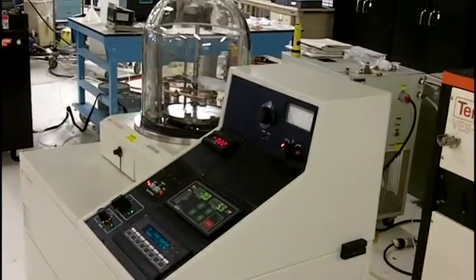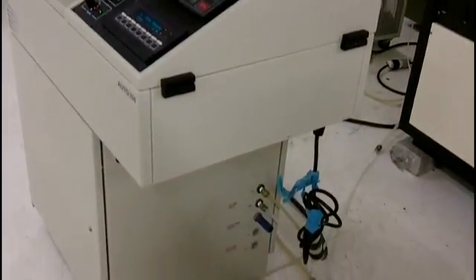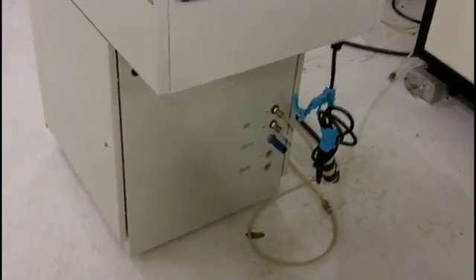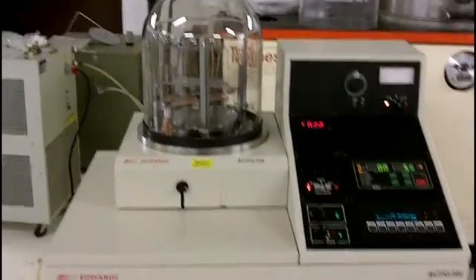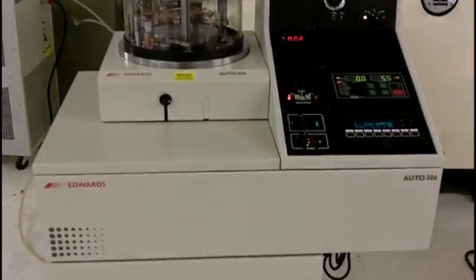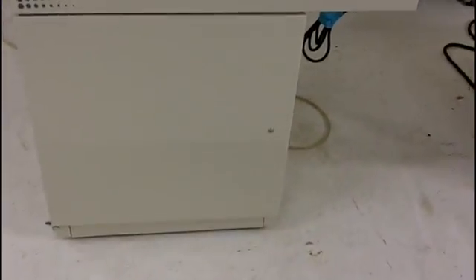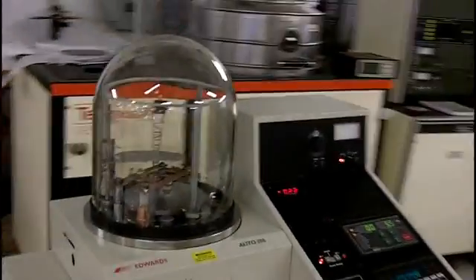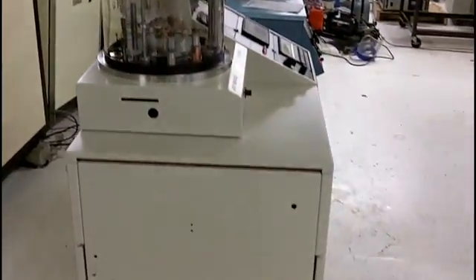Now I am going to show you the left side of the system, the front of the system, the right side, and there we are.